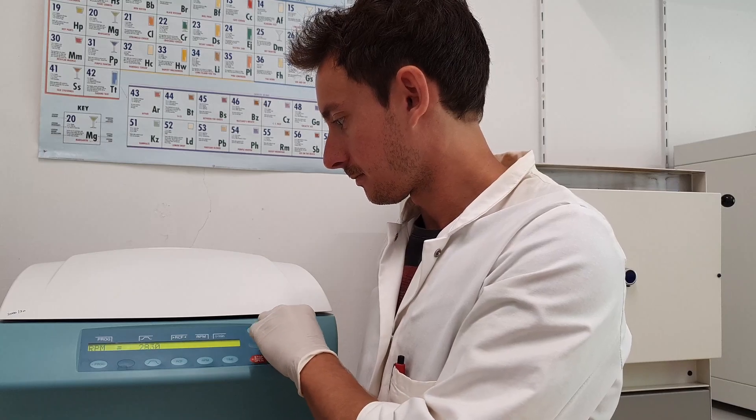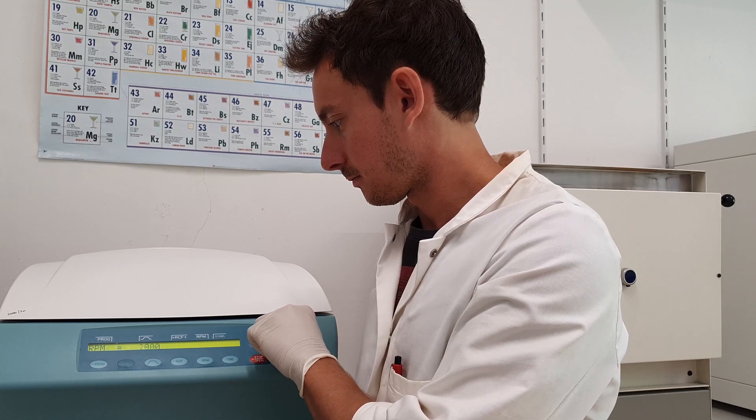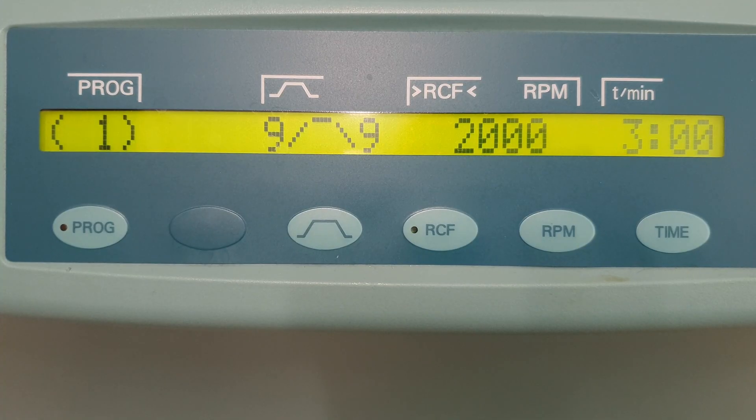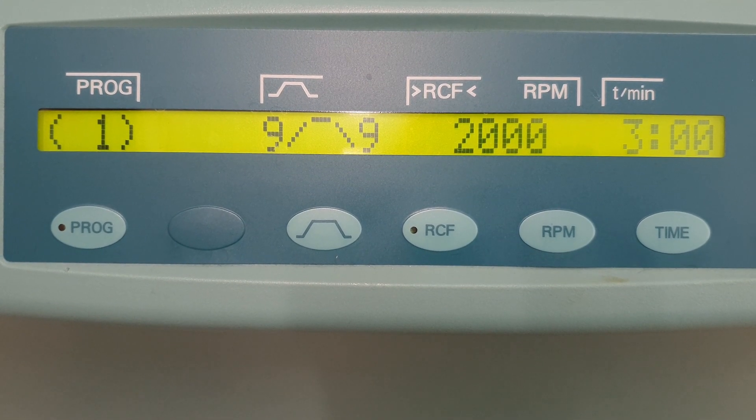When using a centrifuge, make sure that the centrifugation settings do not exceed 2500 rotations per minute. Otherwise, long pennate diatoms are likely to break. We recommend centrifuging at 2000 rpm for at least 3 minutes.